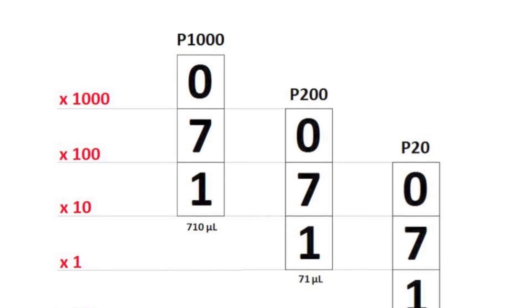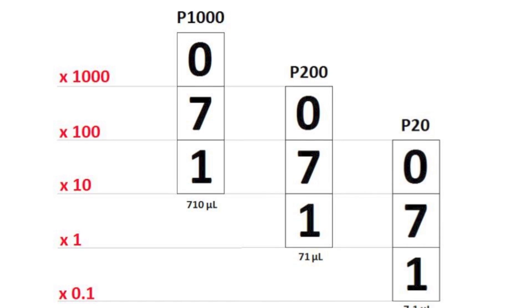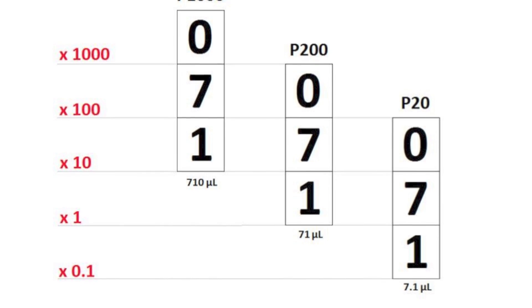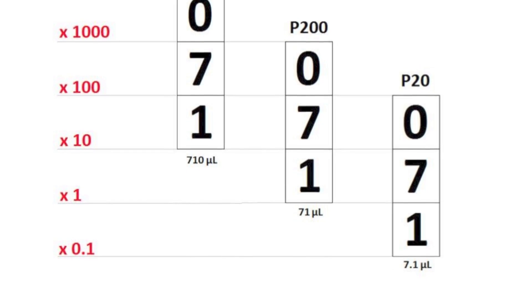For each size of the micropipette, be aware that the digital volume indicator is read differently. Double check this step to ensure that you have the correct volume set.